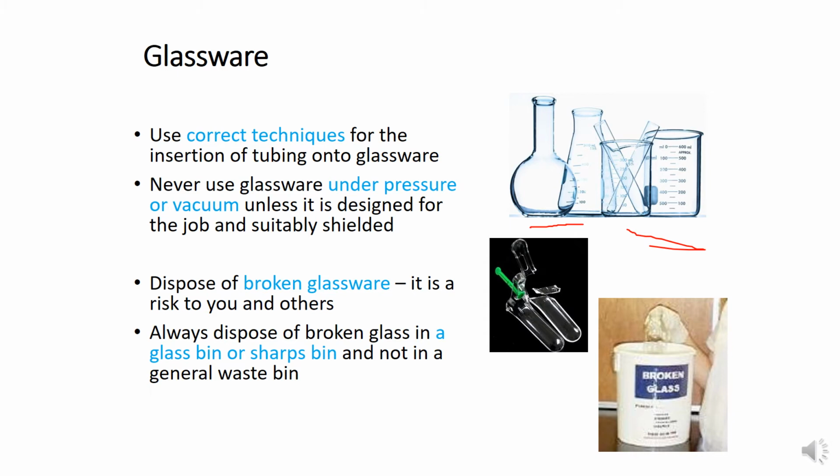So these are the common activities that happen. The only thing that is very important to remember as a student, of course, is first the usage, and second, if some unforeseen incident happens, how you deal with those broken glasses. This is really very important. So, their disposal. Forget about your experiment. It is your duty to properly dispose of your broken glasses.